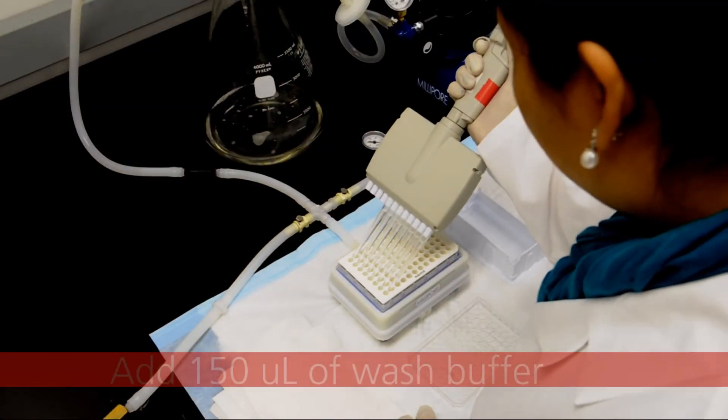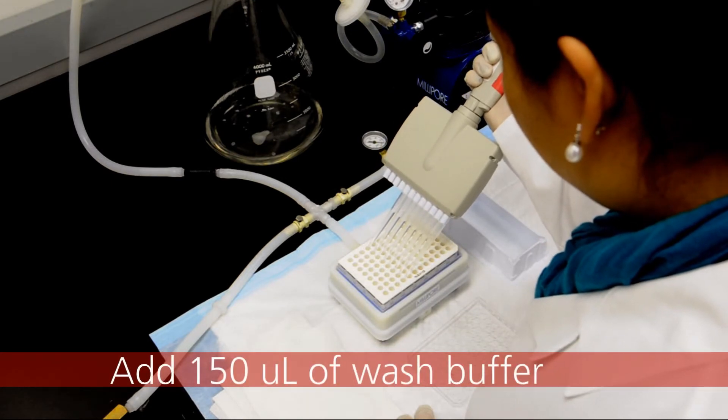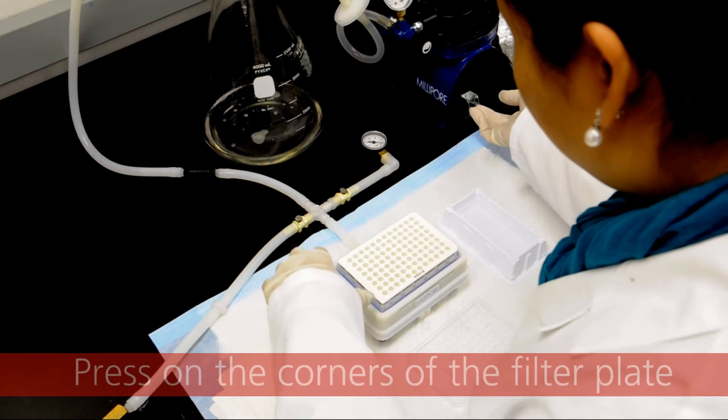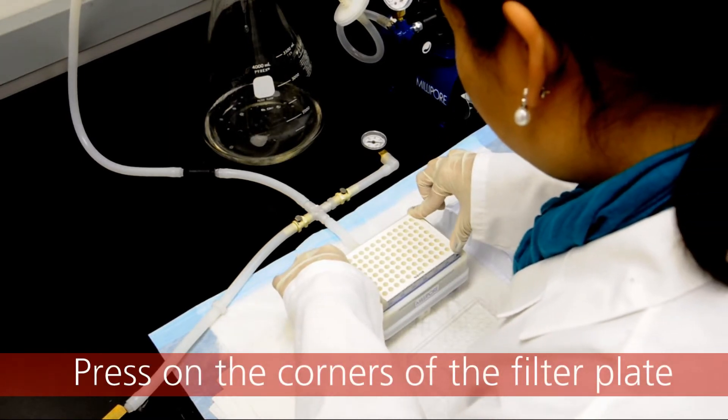To wash the plate, pipet 150 microliters of wash buffer into each well. Turn on the vacuum manifold and evenly apply pressure to the outer four corners of the plate.